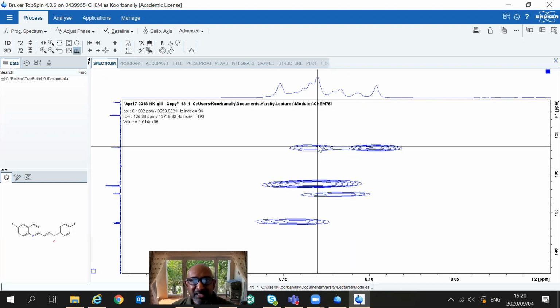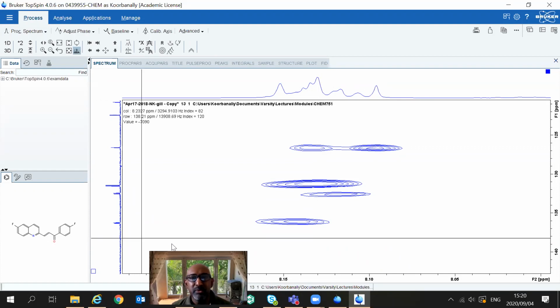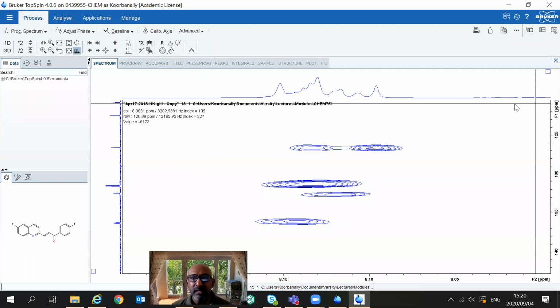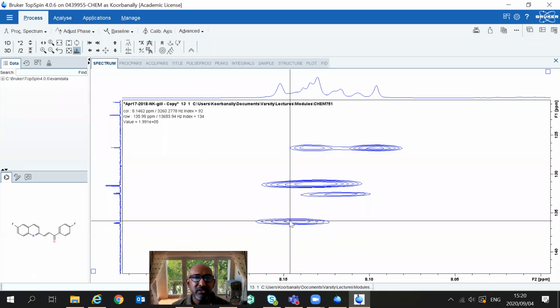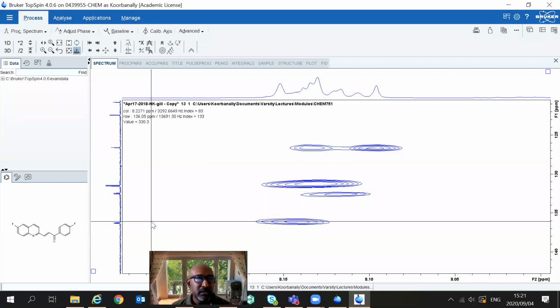And also, can you see the large coupling constant here between there and there? So I can pick out this peak and this peak as being the doublet. So what was initially a mess because of all the overlapping peaks, I can now get a nice value for that doublet here and there, because I know that that's one of my trans-olefinic protons. All right, so it's just a very advanced way of looking at this particular spectrum. And can you see that the other proton that you have here is in this region here, and that the doublet is in this particular region.